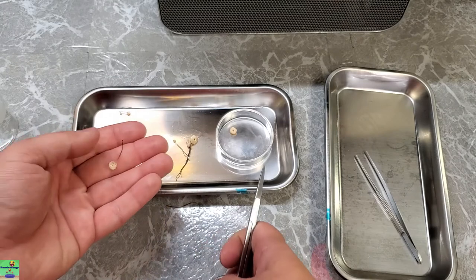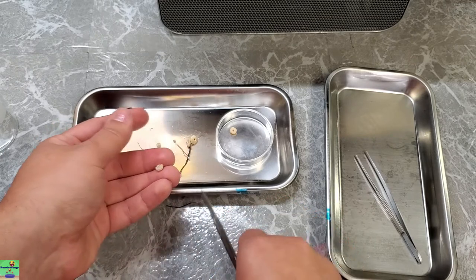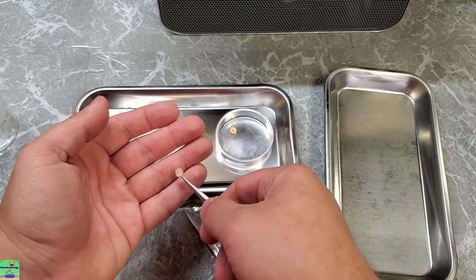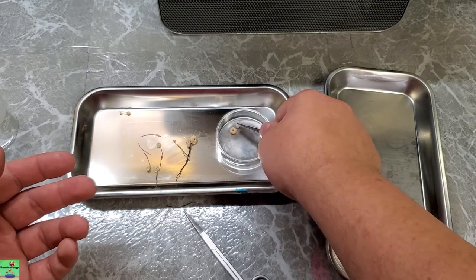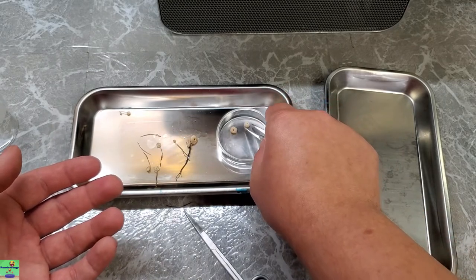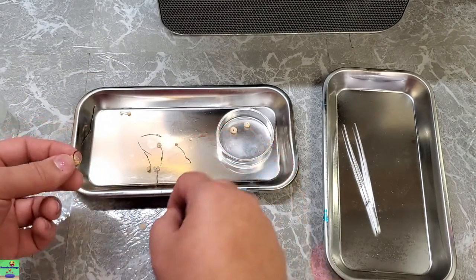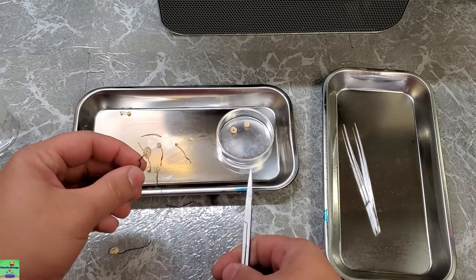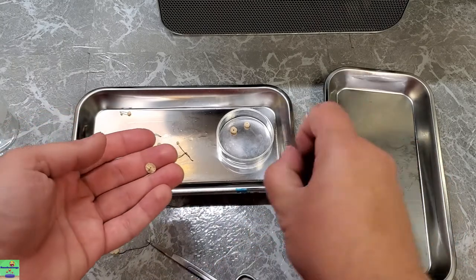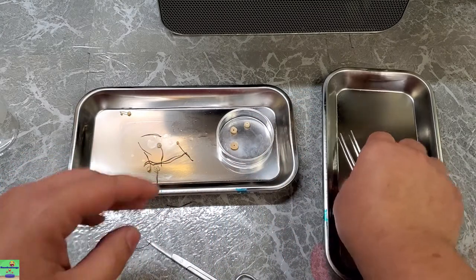Now we're not super concerned with contaminants right now. There's not really any way that we can, at least in the home setting, do this in a completely sterile process. But I've noticed that whenever you take spore samples like this from wild mushrooms, as long as you're relatively careful and relatively clean with your procedure, you normally have pretty good success. And you don't have to worry too much about contamination. You can always isolate mycelium from a contamination once it's on agar. You might have to do a couple different transfers, but this is a pretty good method right here. We're just gonna do those three.